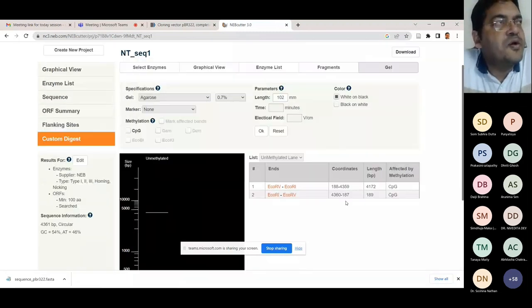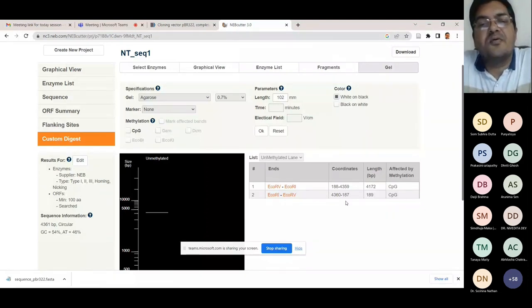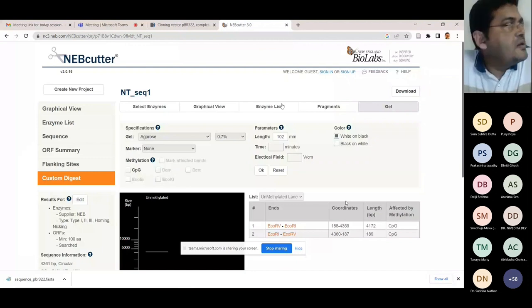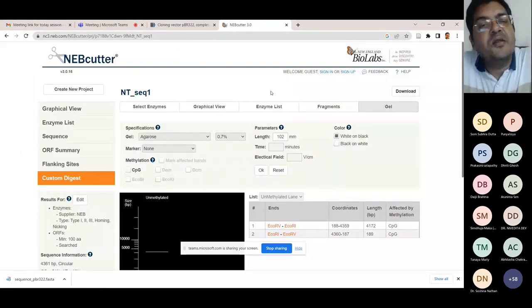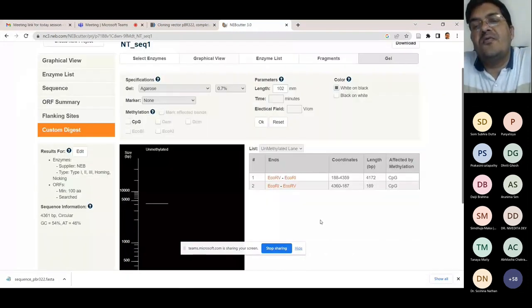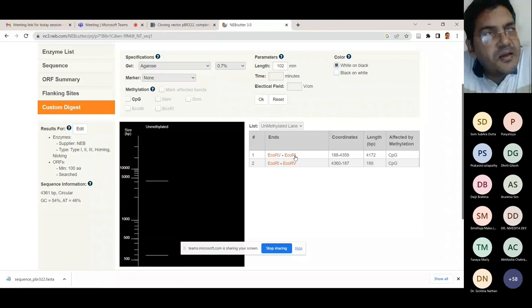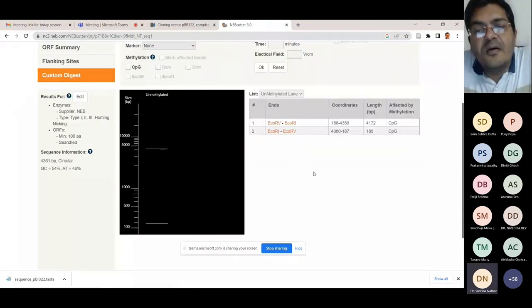Sequencing is now so affordable that it is often easier to sequence than to confirm results by Northern or Southern hybridization. PCR-based methods can also replace probe-based fingerprinting. This restriction digestion exercise tells you the number and size of fragments expected. Importantly, if one of the two recognition sites is mutated, only the intact site is cut — for example, if the EcoRI site is mutated, only EcoRV cuts, linearizing the circular plasmid to give a single 4361 base pair fragment.